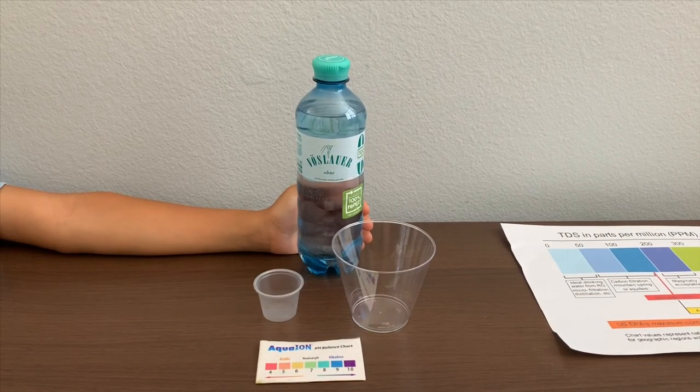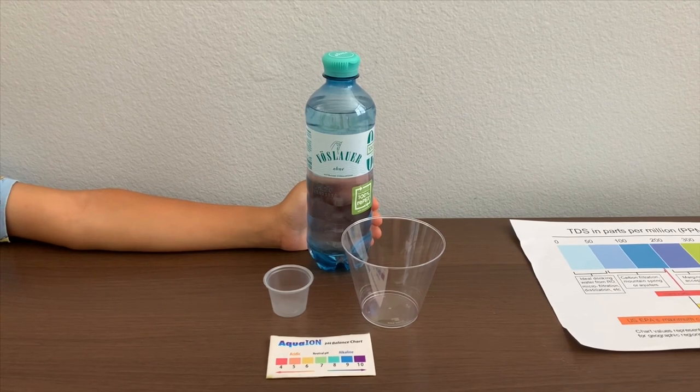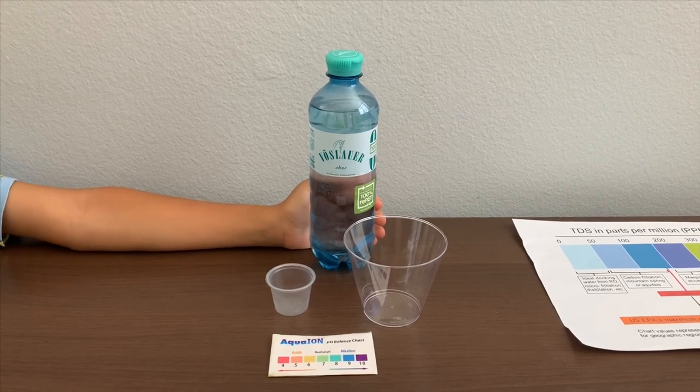This is Vöslauer water — only mineral natural still water. We bought it from the Austrian airport. Let's test the pH and TDS levels.